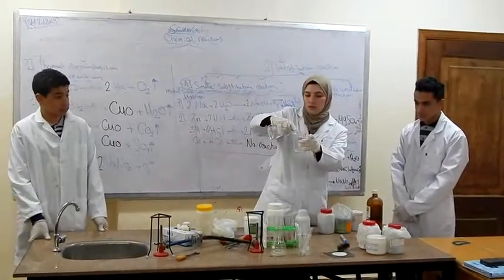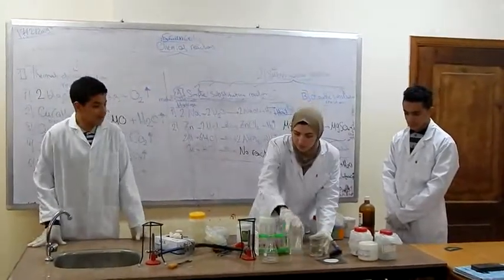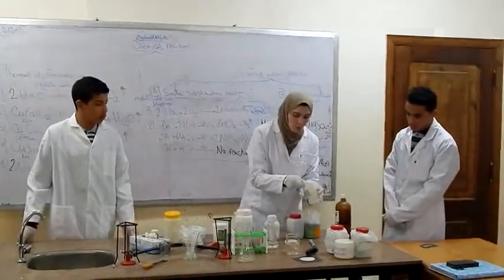Put water in a beaker, and then a small piece of sodium metal. Just a small piece.